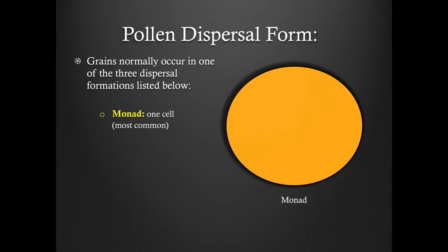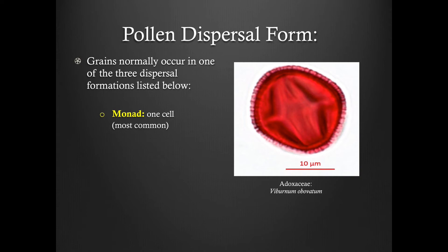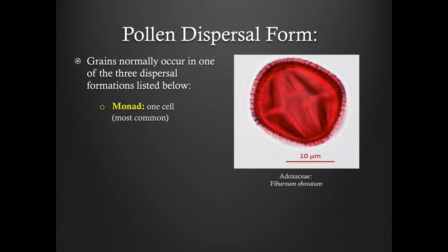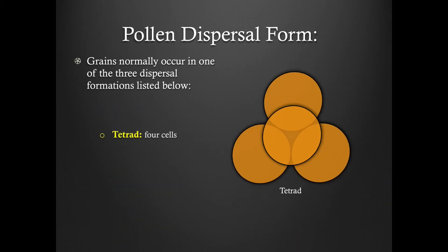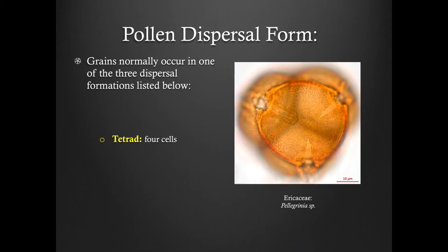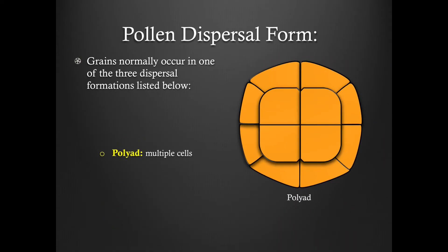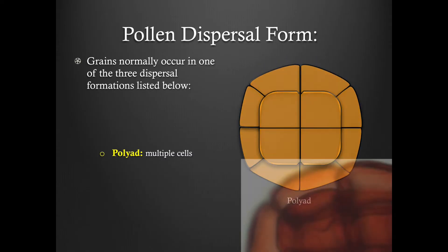Monads are single-cell pollen grains. Here is an example of a monad. Tetrads are pollen grains comprised of four cells. Here is an example of a tetrad. Polyads consist of more than four cells. Here is an example of a polyad.